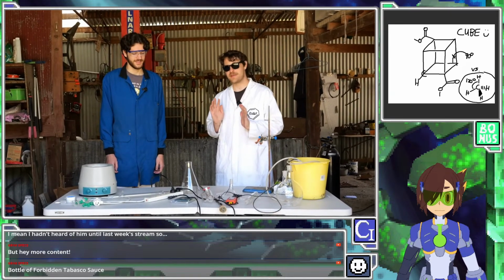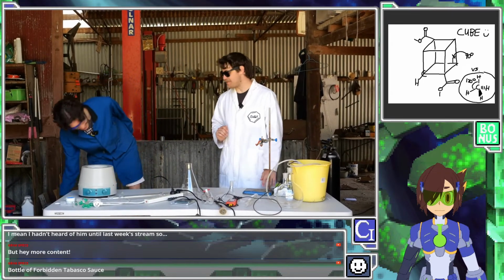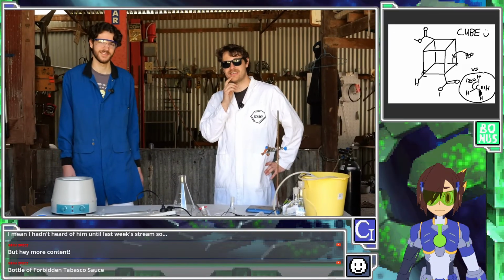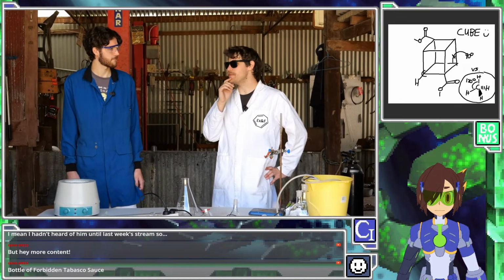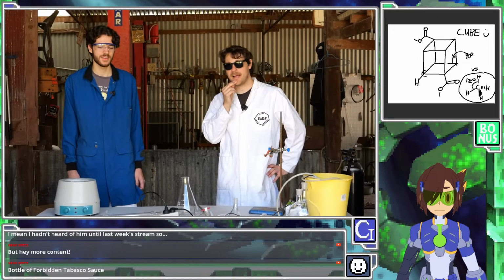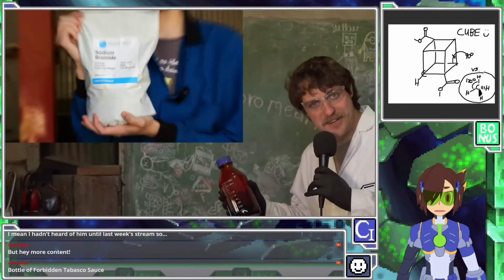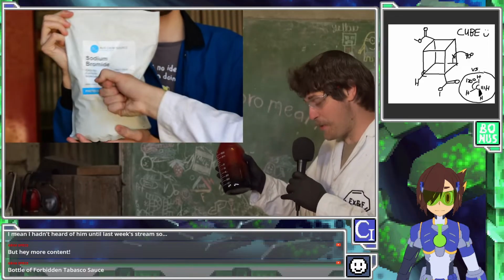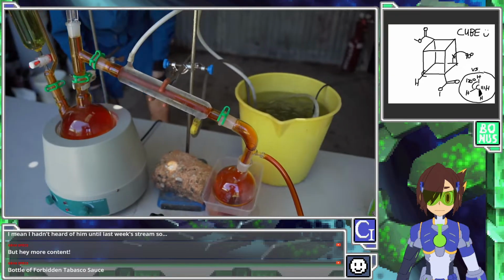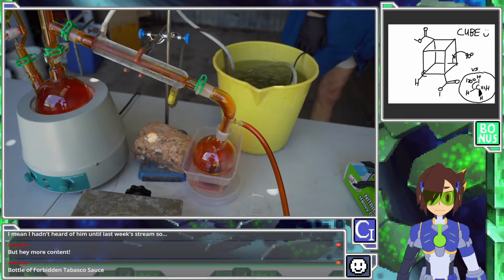Yeah. So as much as we are going big scale, we're going to have to really do it. Ice will solve everything. Yeah, and we've got to not drop a whole liter of bromine on the concrete at any point. We've got to avoid that. The concrete will absorb it and react with it. It's fine. This is with the goal of making 1 liter of bromine in a day. So that's nearly 3.5 kilos of bromine.